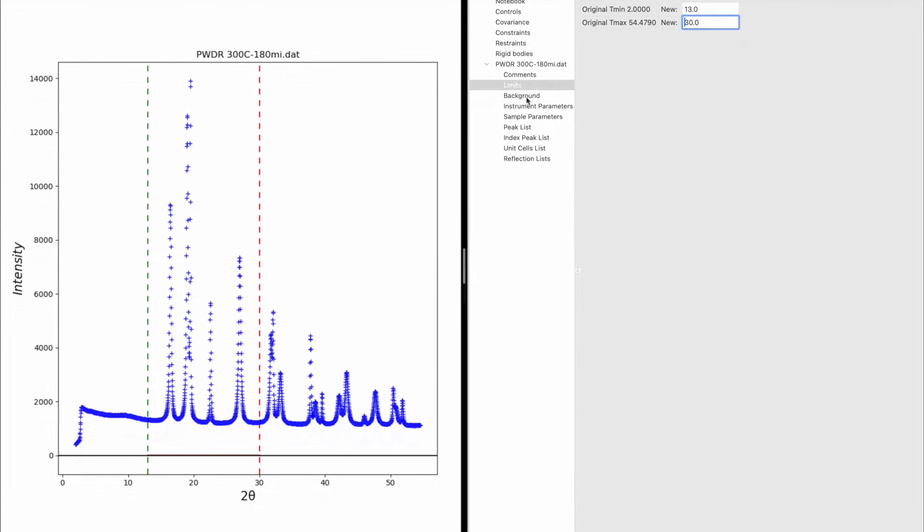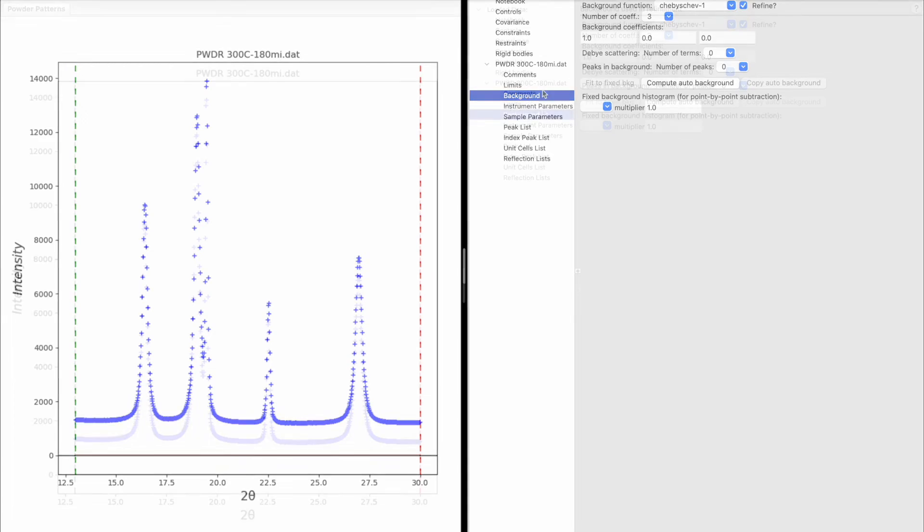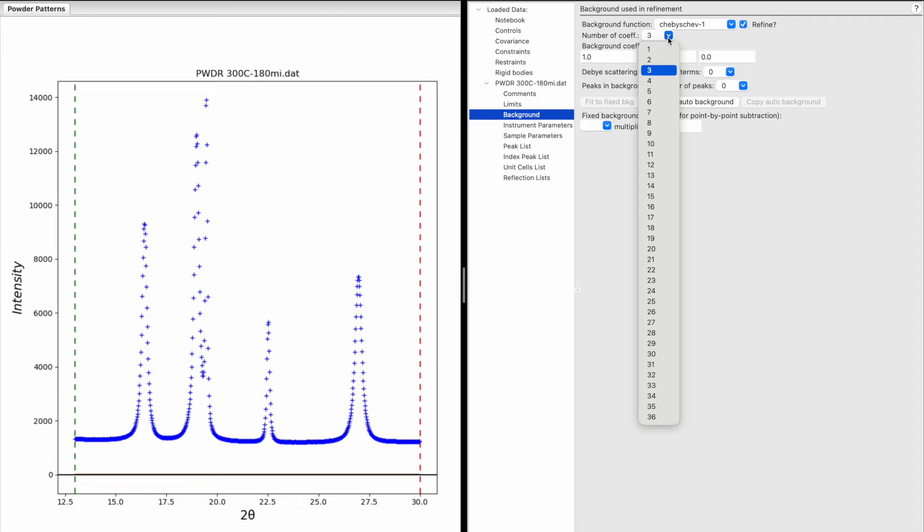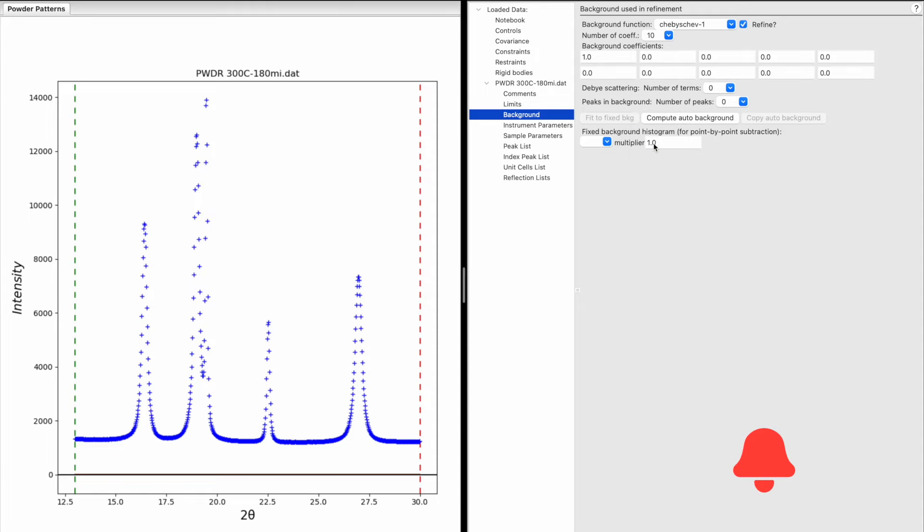Click on Background. The intensity is good and the background looks flat, so choose around 10 coefficients to fit the background, keeping the default background function.